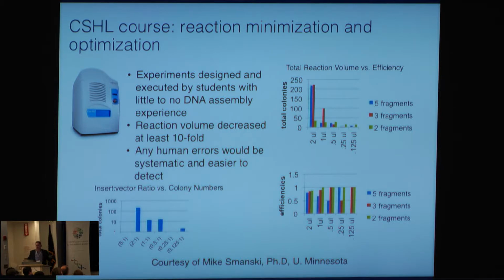This is fairly routine if you are a DNA foundry, but these were students with little to no assembly experience. So they were able to knock this out, and using something like Golden Gate, they were able to permute the elements at will, given our ability to dispense from any well to any well.